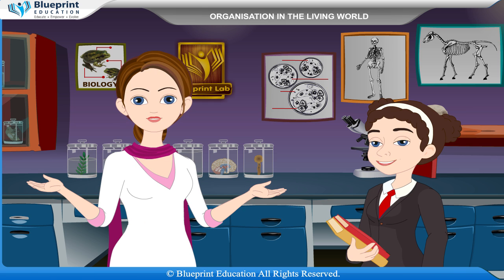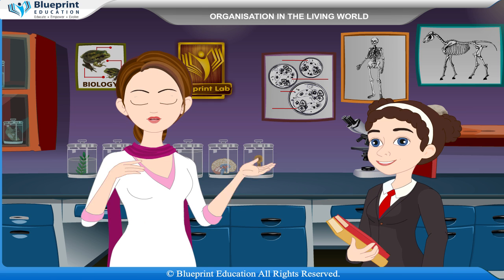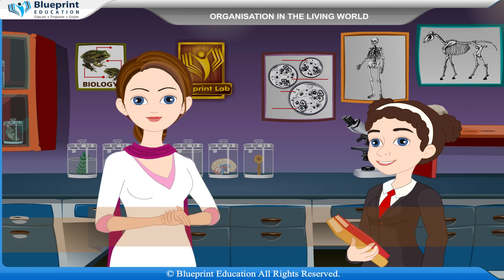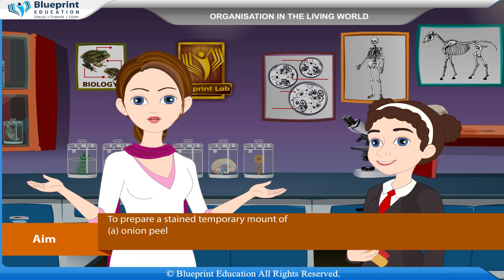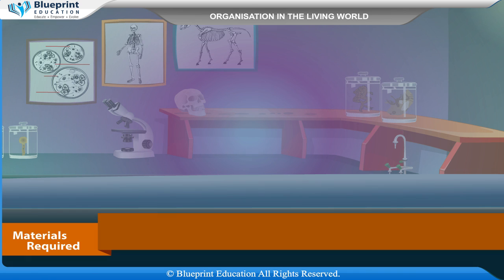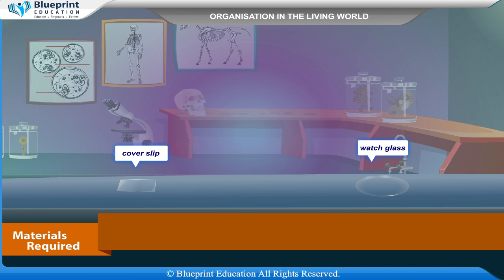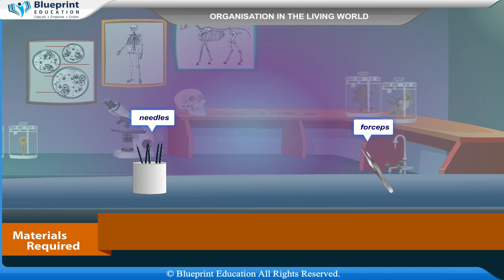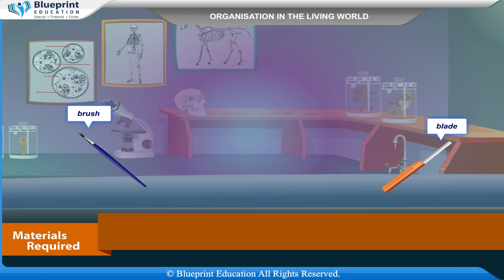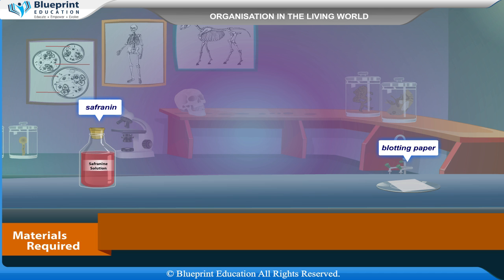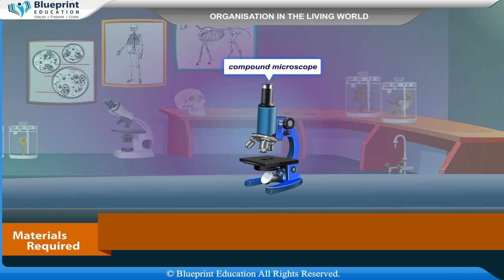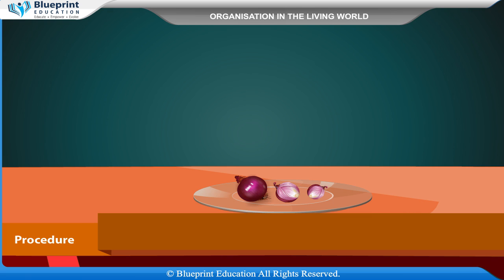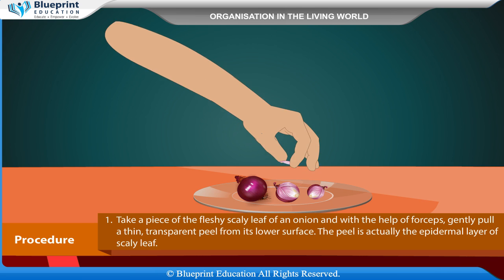Let's do an experiment to prepare a stained temporary mount of onion peel and human cheek cells. Materials required are: onion, plain slides, cover slip, watch glass, needles, forceps, brush, blade, safranin, blotting paper, distilled water, glycerine, and a compound microscope.